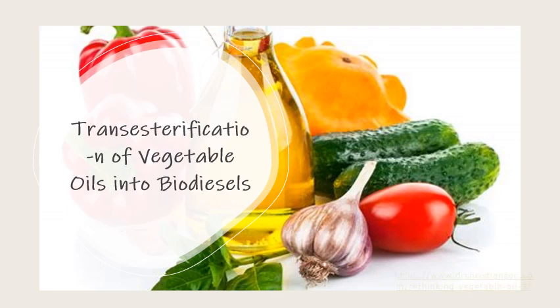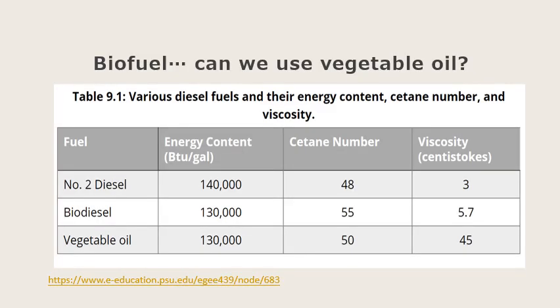Today I'll show you the steps of making biodiesel and how you can make it at home. Biodiesels are used specifically in diesel engines, whose fuel ignition takes place without any spark. Therefore, diesel fuel needs good compression ignition characteristics.